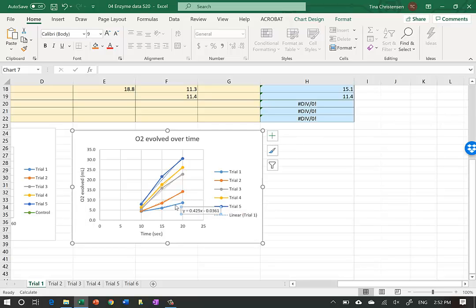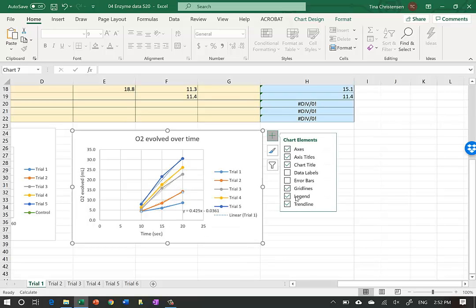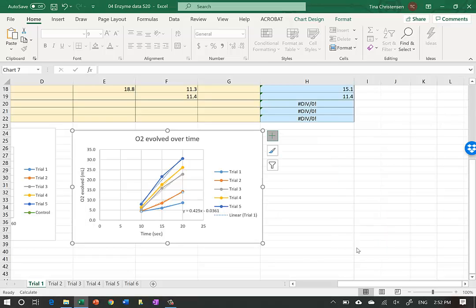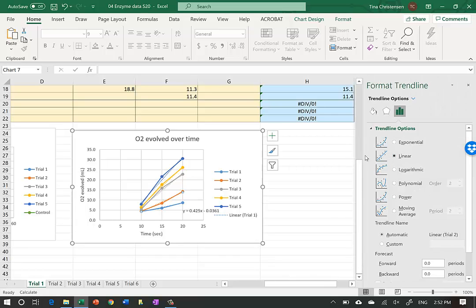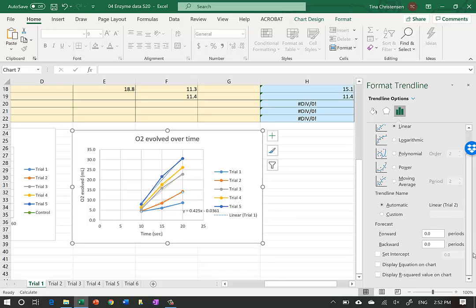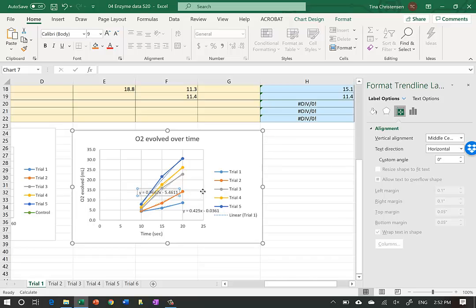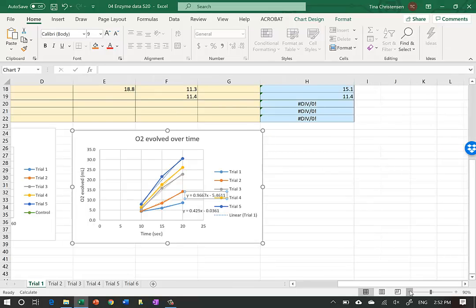Next I click on the orange Trial 2 line and add a trend line with More Options. I make sure it's on Linear and scroll down to Display Equation on Chart. That gives us the equation for Trial 2. I move that label over to the side and close the panel.